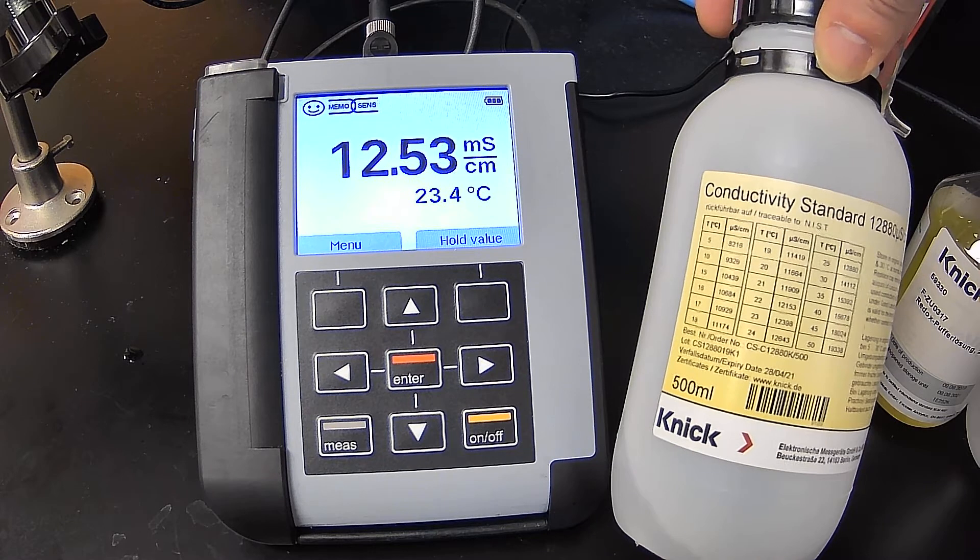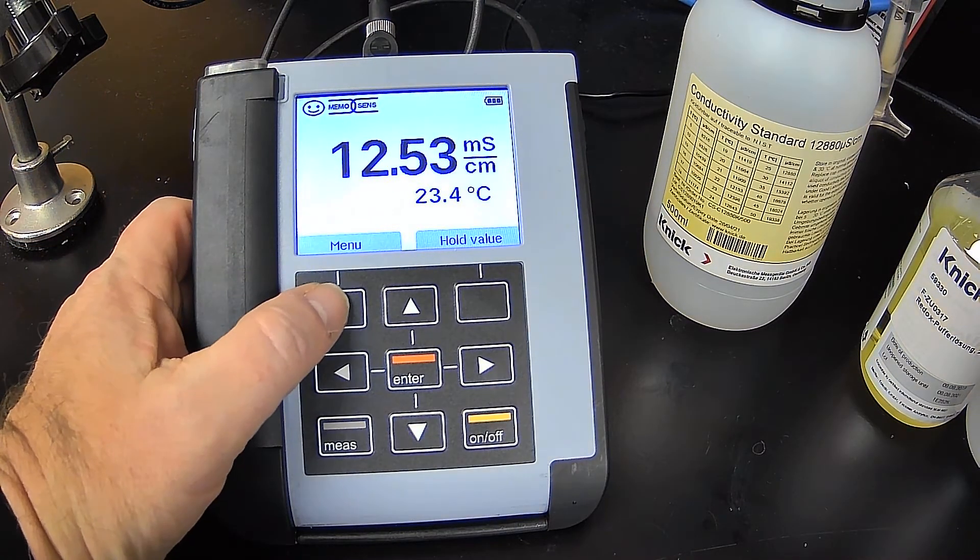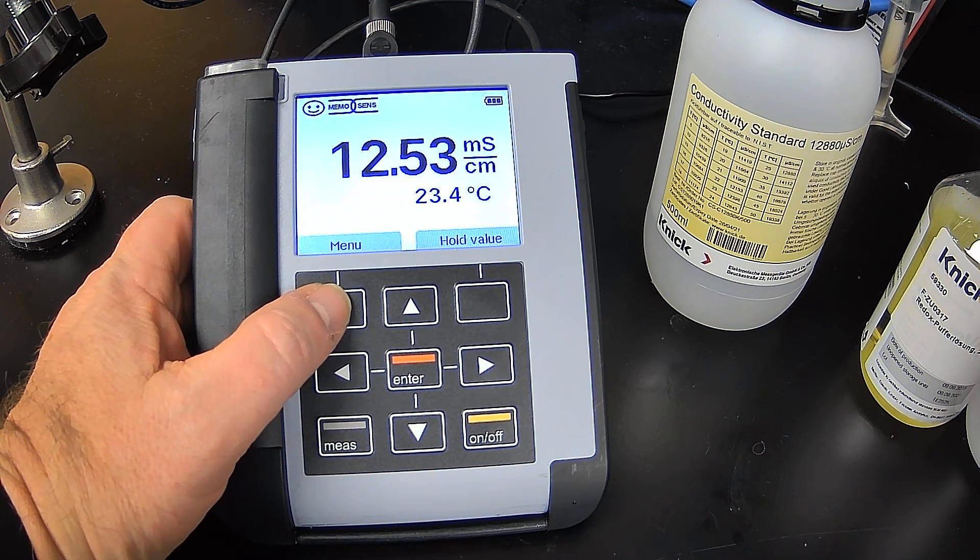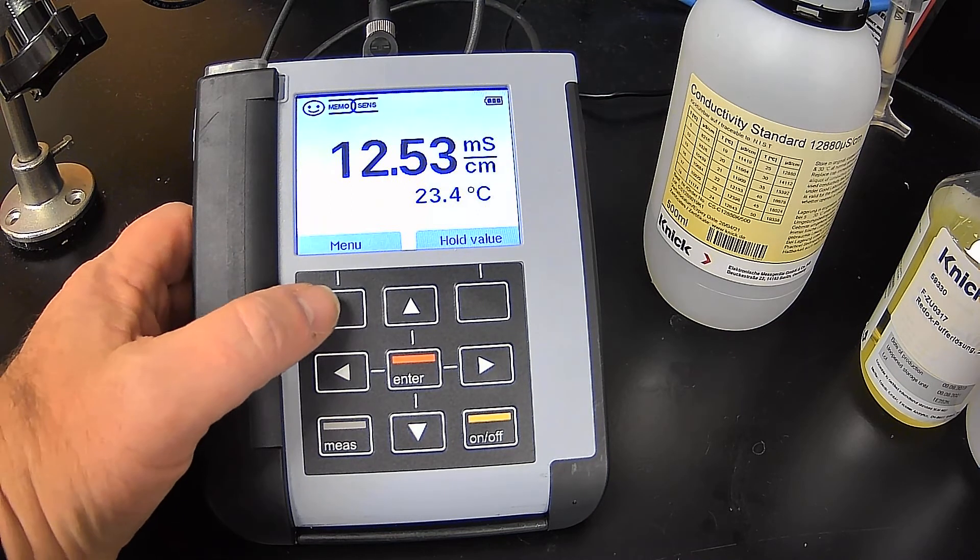Because we're doing a manual calibration, we need to make sure we use the solution value at the temperature we're currently reading, or as close as possible. In this case, we're at 23.4 degrees Celsius.